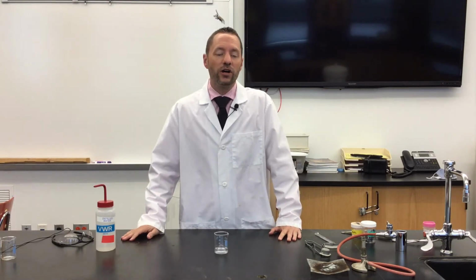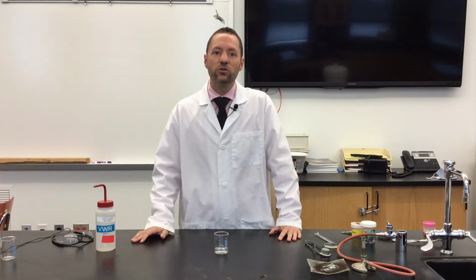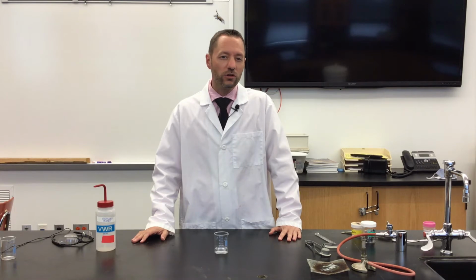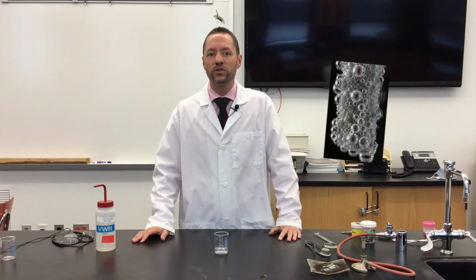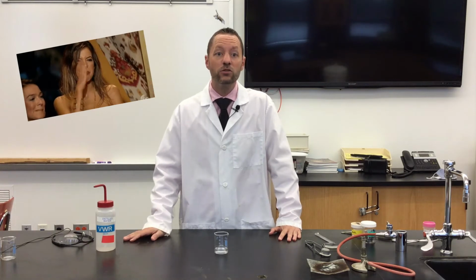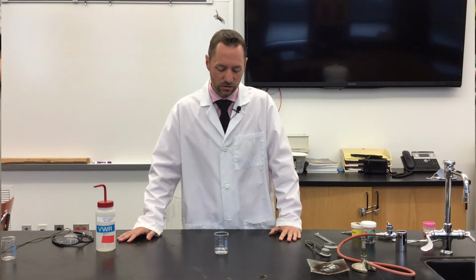Now that we have the water and the magnesium in the beaker together, we're going to look for signs of a reaction. Things like release or absorption of energy in the form of light or heat. We will also look closely to see if we have the production of a gas. We could check for the presence of a new odor. So let's have a closer look at the magnesium in the water and see if we can notice any indicators of a chemical reaction.